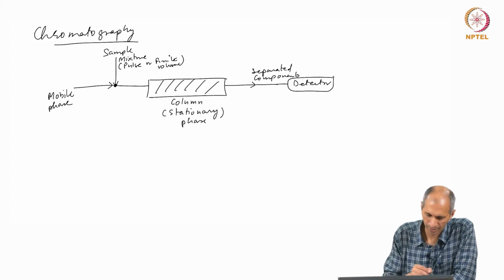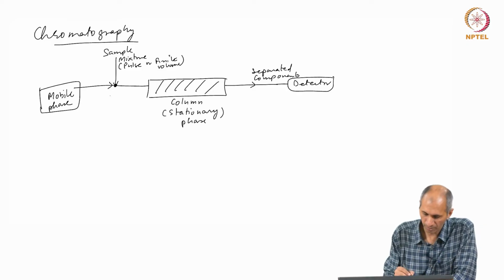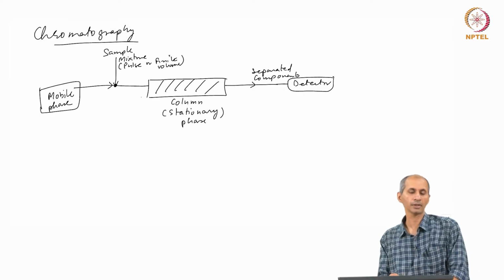So, there are very specific components of this. The main purpose of the column is the separation.